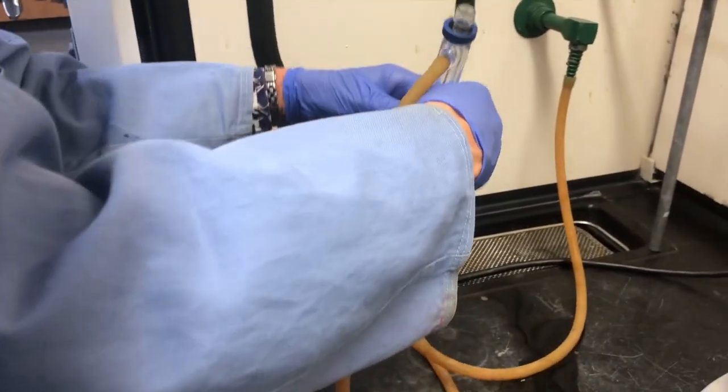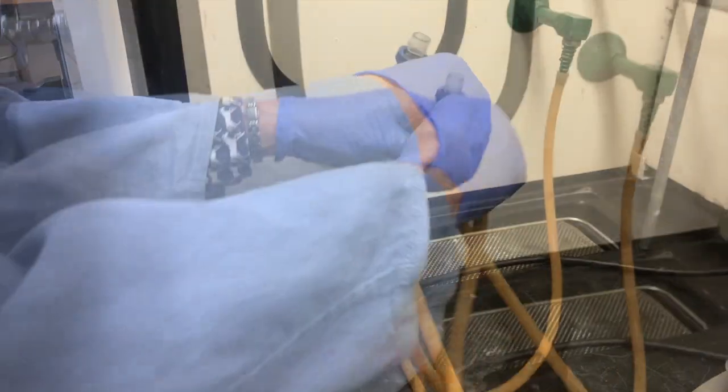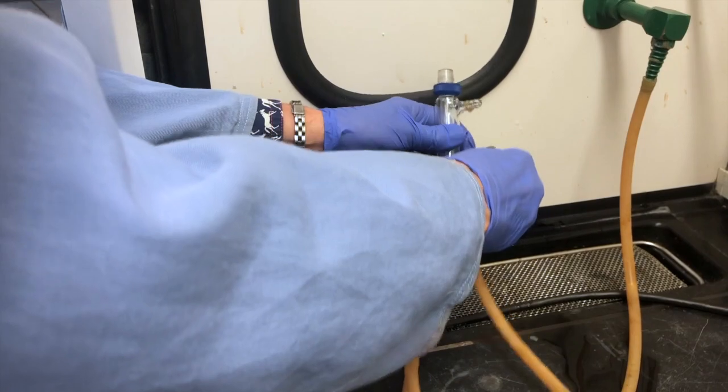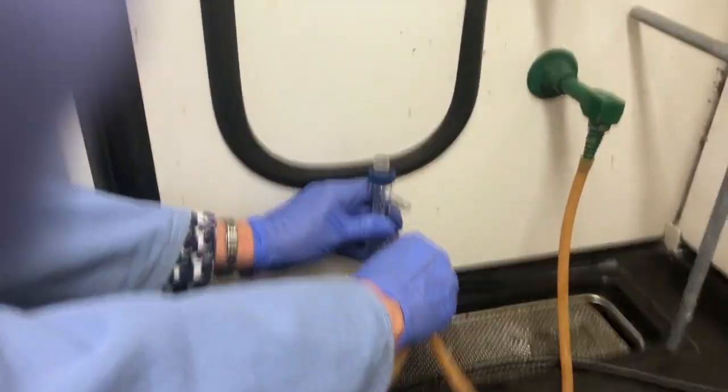Then we begin to remove the tubes from the condenser and if you're clever you can remove them over a sink and not get anything wet. Use gravity to try and figure out which one to remove first.